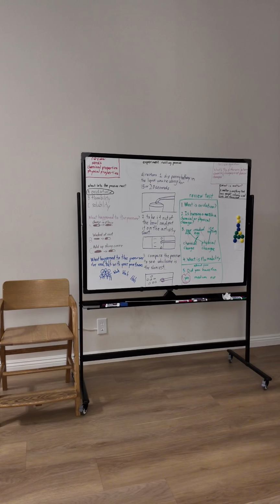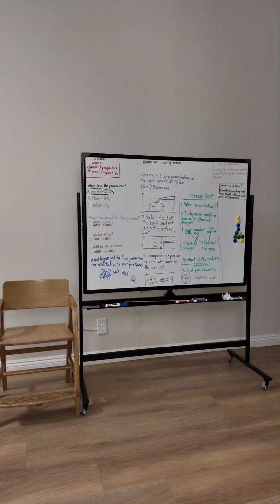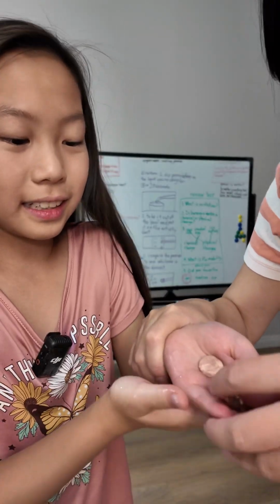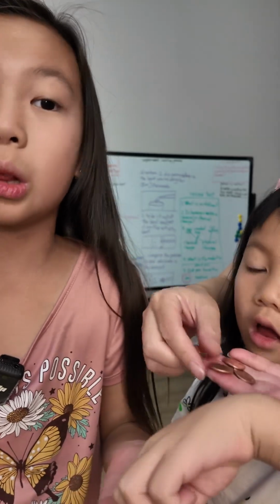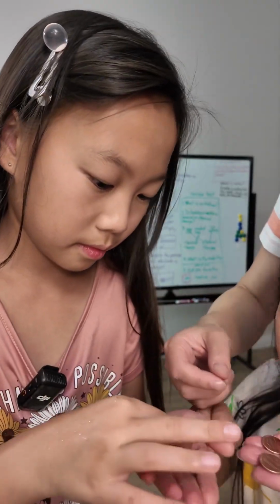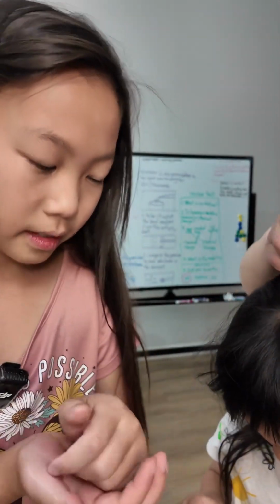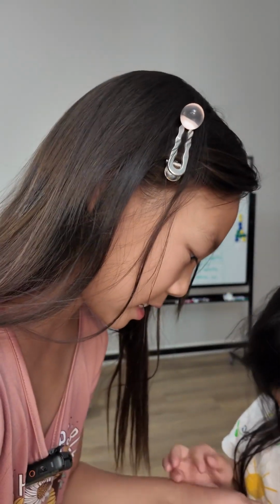Okay, while you've been taking notes, something amazing has happened. All of these pennies turned bright. Oh, really? Like this, and this, and look. Wow. Even this one turned shiny, but it has gone a lot of time. Magic. Wow, it looks like new. I know. It's a new one. I washed it too. Wow, it's amazing. Very amazing, isn't it? Yeah.